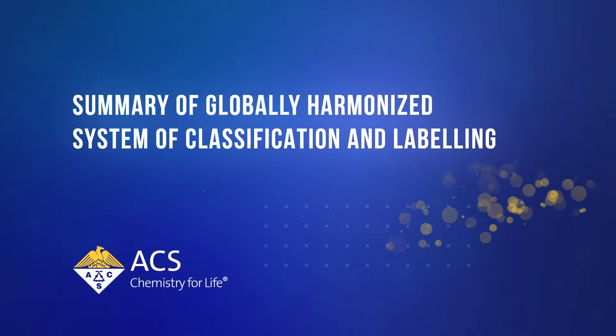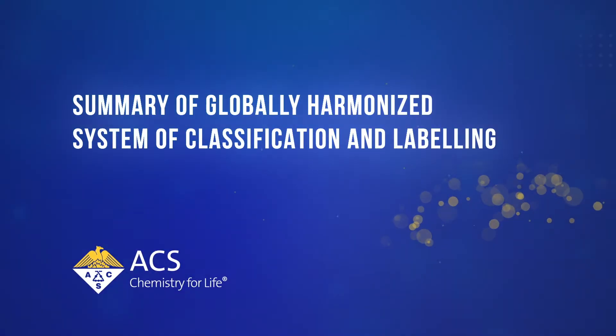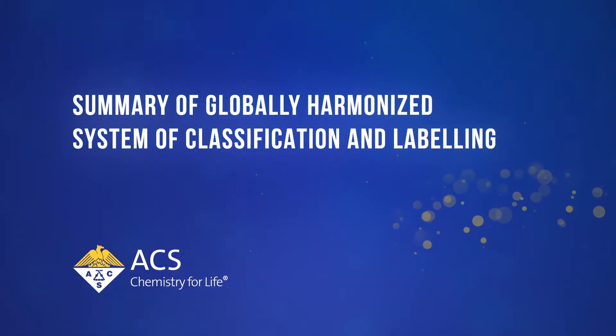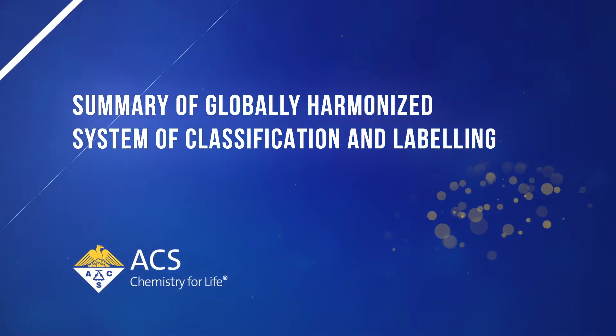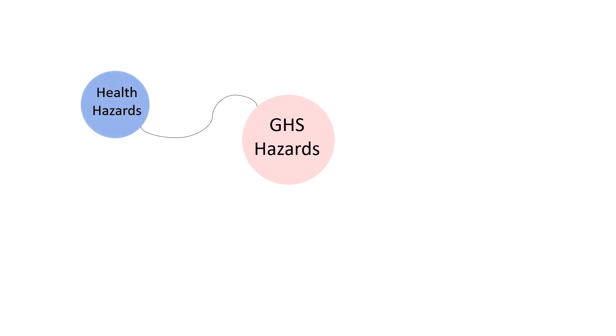In the globally harmonized system of classification and labeling, abbreviated GHS, chemical hazards are placed into three broad groups. Chemicals in the health hazard group cause or are anticipated to cause injury, illness, or disease in humans.